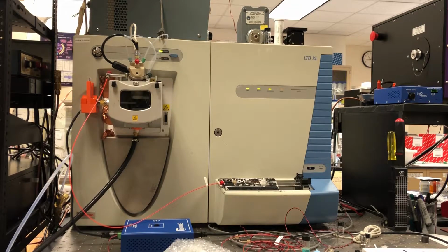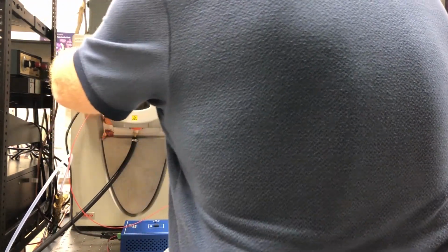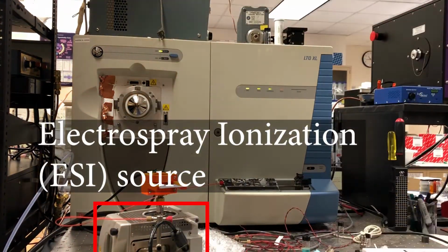So here's one of our mass spectrometers. This is an ion trap I use in my research. And this is an electrospray source on it. It's actually a modified source. We modified it for research. But you can just pull the ion source off the instrument. That doesn't need vacuum, so there's no vacuum chamber, so you can just pull it off. That was the electrospray ionization source. Truthfully, it was modified a little bit.